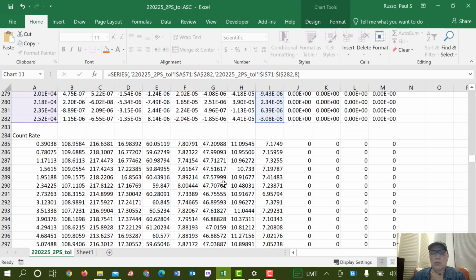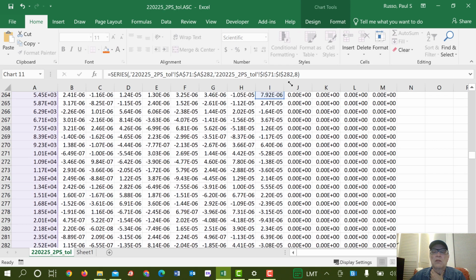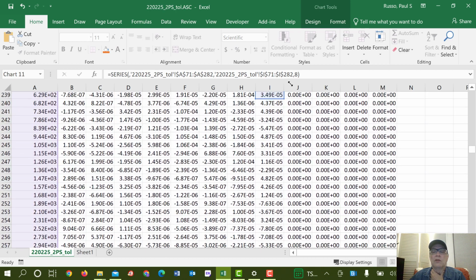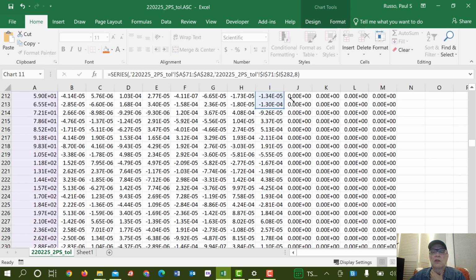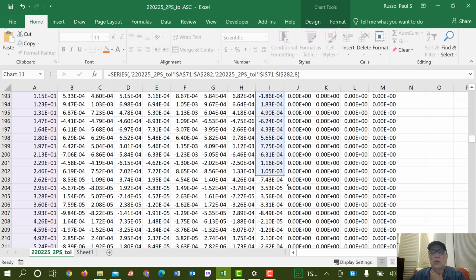not desirable. So we'll do this kind of the hard way, I'm afraid. Sometimes I can get it the easy way, sometimes I can't. So 10 to the -3 or so would be probably where these data are going to crap out on us, sort of in there. Let's see, was that a nice even number? It's 204. Let's go for 200.